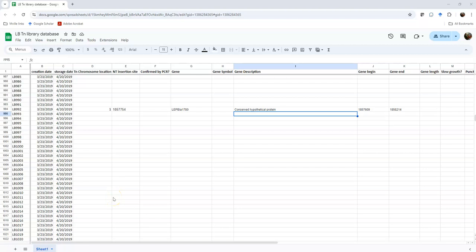Hey, welcome everybody. This video is being made for my research students, but I'm sure other people could use it as well if they just want to know how to do primer design. So the purpose of this video is to learn how to do primer design based on a gene that you have identified and perhaps a certain sequence in there, and you want to amplify around that sequence.